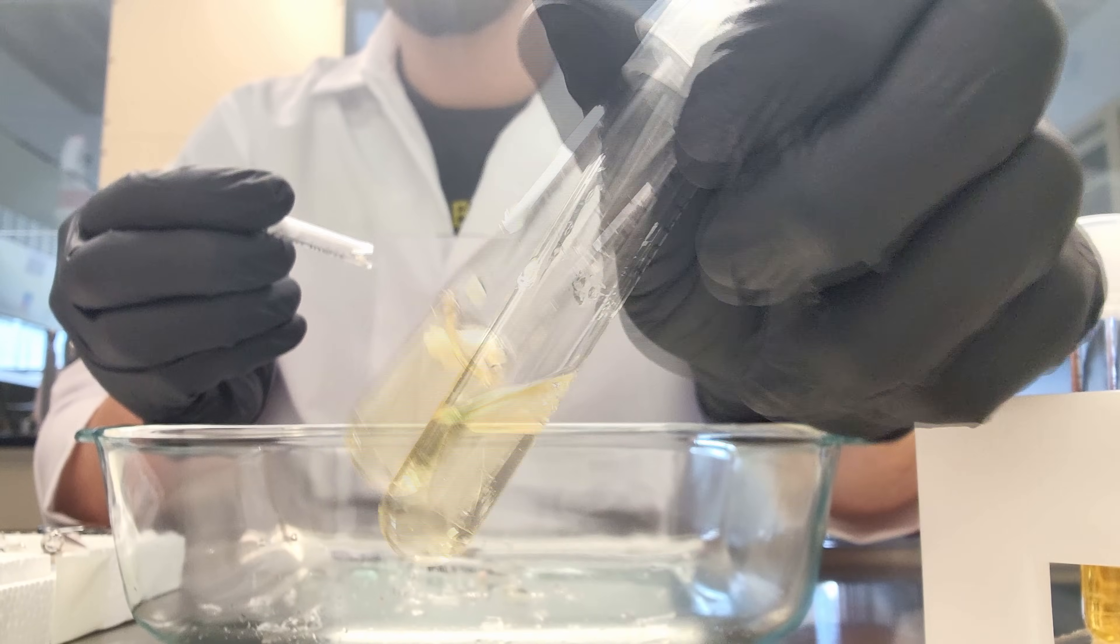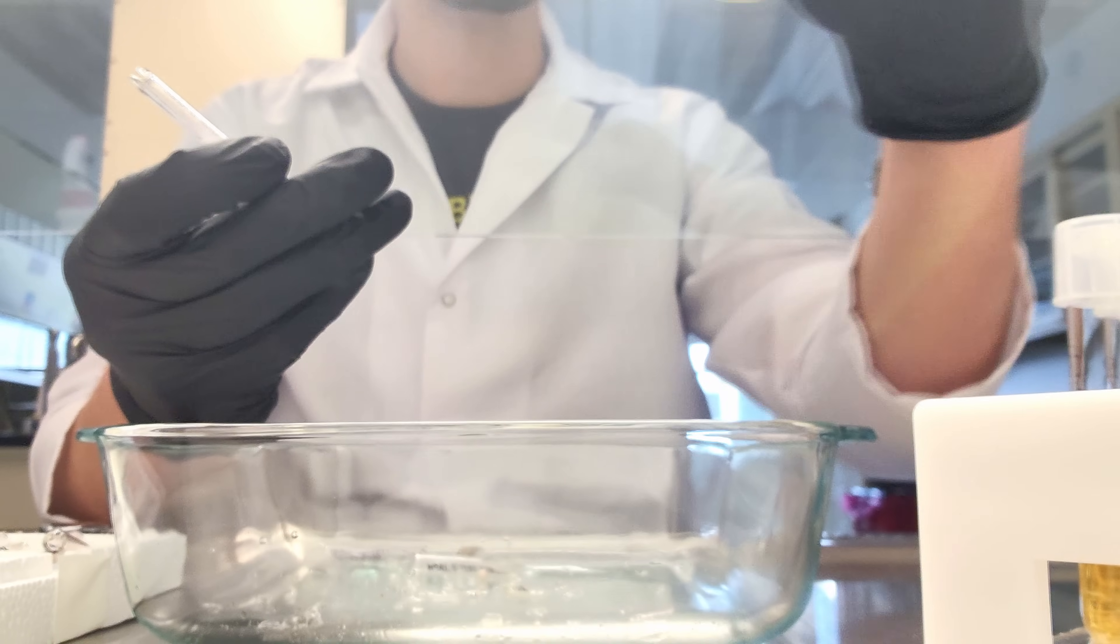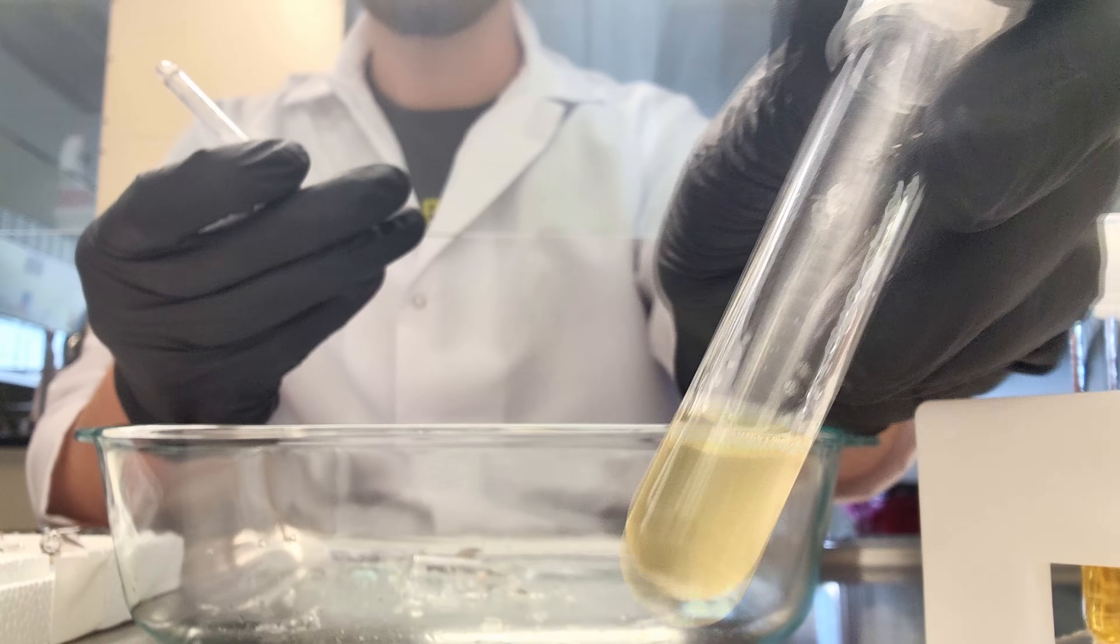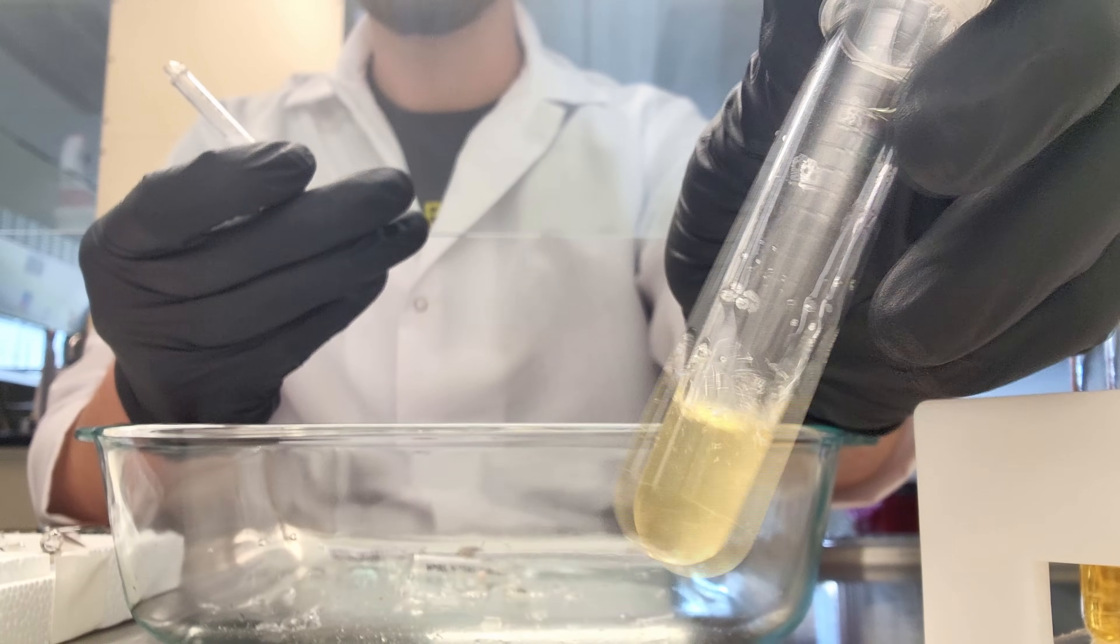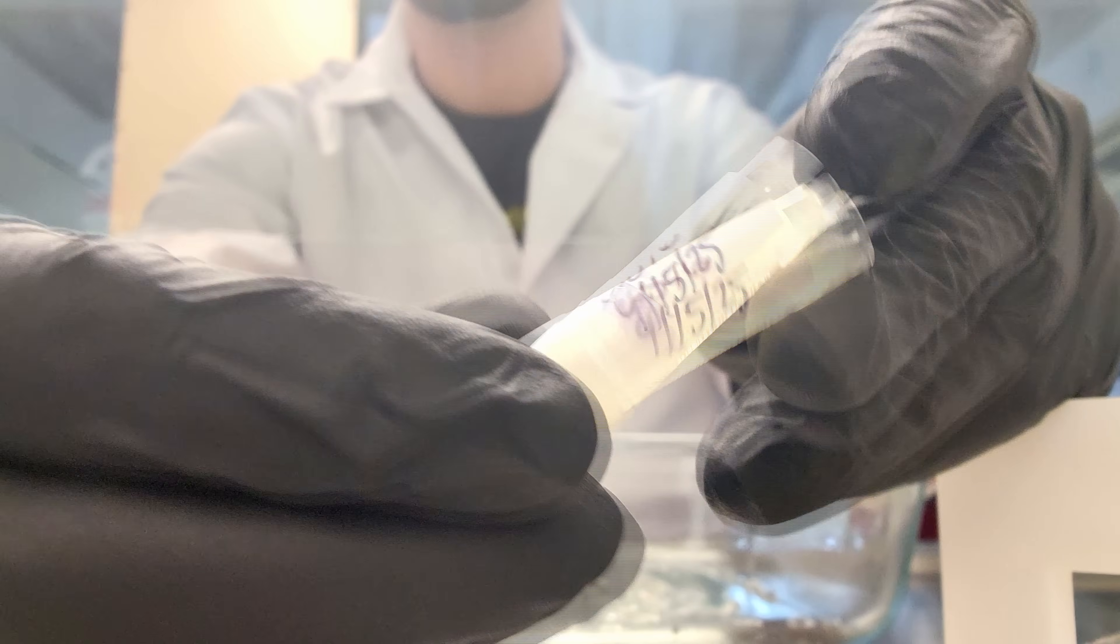If the streak plates don't work out, I'll have these in the fridge to go back to later. Out of the 31 samples that I've streaked, only two had any issue, and I'm going to blame the culture collection on that one. You can see it was resuspended nicely.